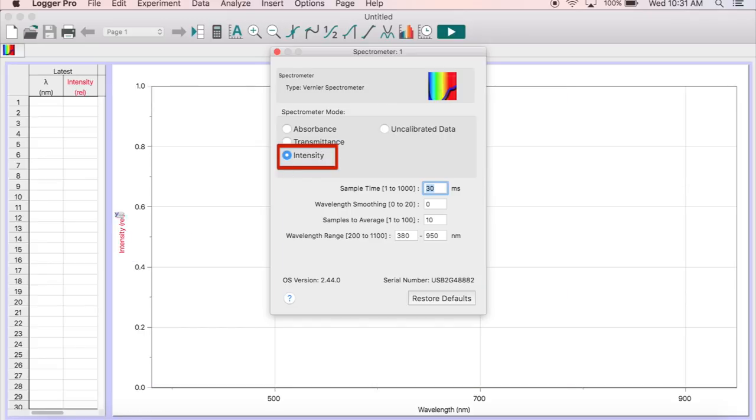Because the light intensity from the solution is too low, you will have to adjust the scan time. Select Sample Time from this menu and set it to 500 milliseconds. Leave the other settings alone. When finished, close this menu to update the settings.